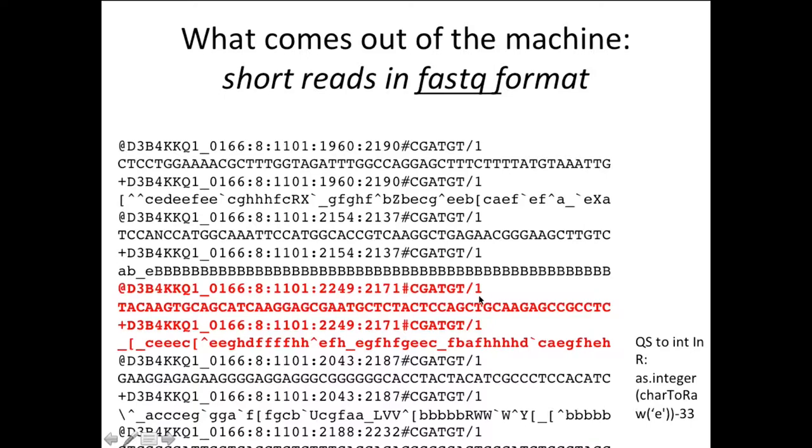Now, as you can tell here, there is some level of redundancy, right? It's not really clear why you should have a duplication of this line. The problem is that these files get very, very large. This is actually coming out of an early Illumina format. It's coming out of a machine, but basically you have a duplication of some lines like this, which really doesn't make any sense because it increases the size of your file by 25%. So now people have ways to create more complex representations so as to limit the storage that you need.